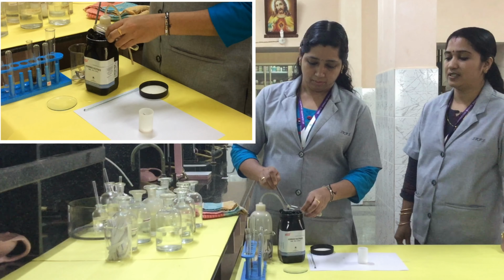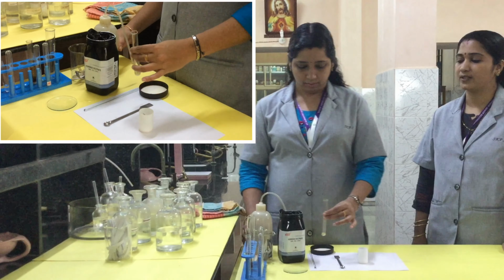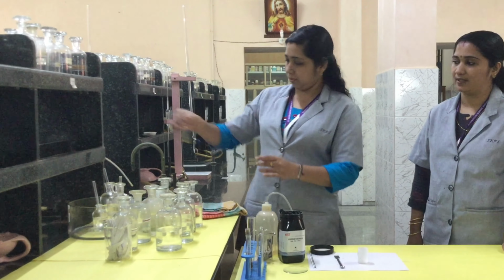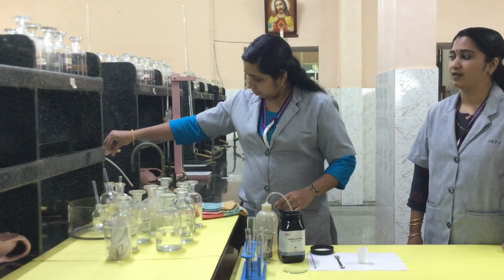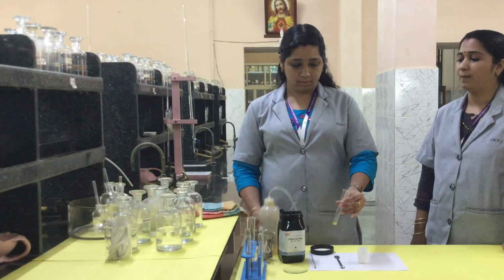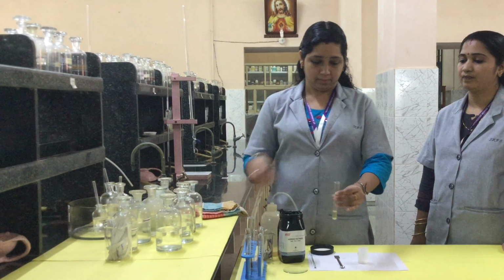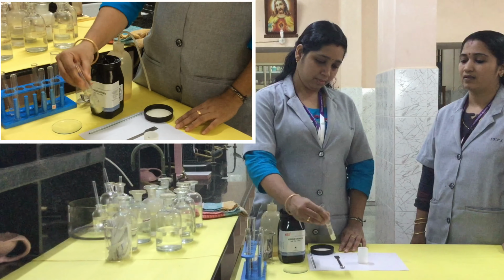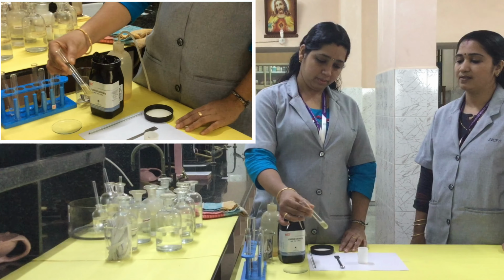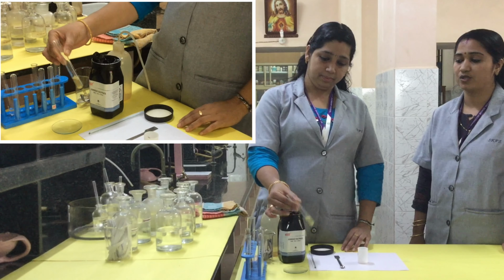A little of the ferrous sulfate is taken in a test tube. Then add some water. Shake it well to dissolve the contents. Then you will get the freshly prepared ferrous sulfate solution.